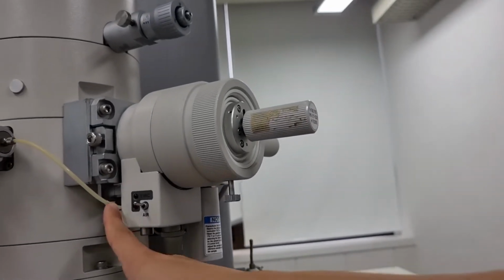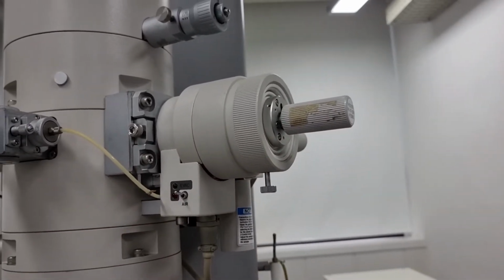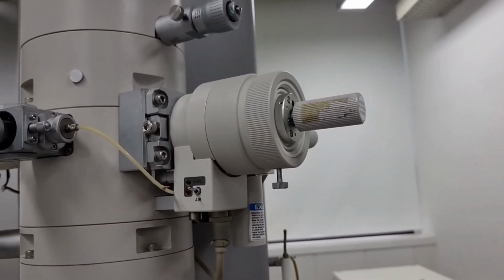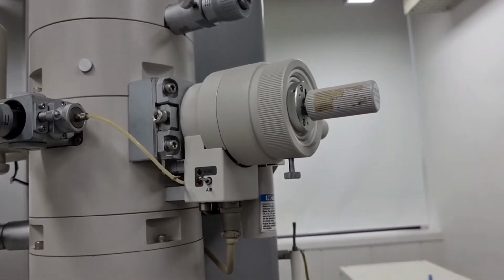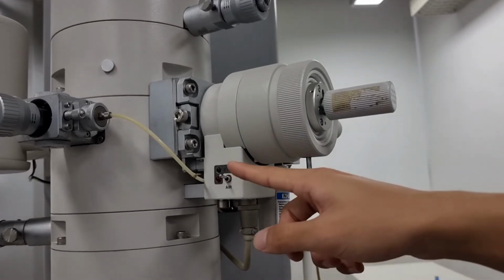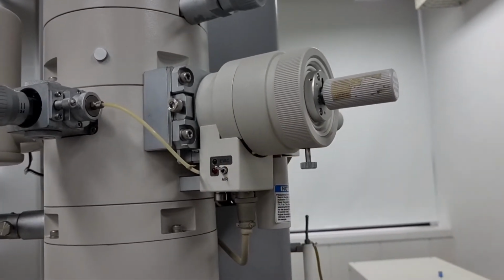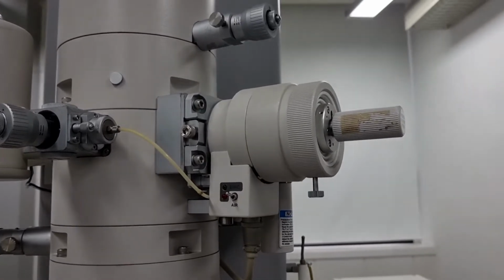After the evacuation button turns on, if you were too busy doing something else, it'll get turned off after a few moments. So if you're not sure whether it's still being evacuated or it has finished evacuating, you should turn it into air mode again to let the air inside, and then switch it on to evac again.